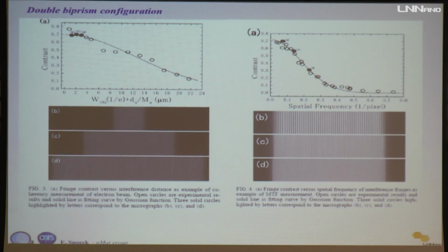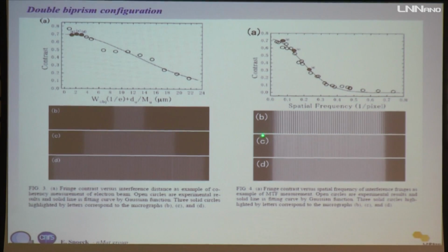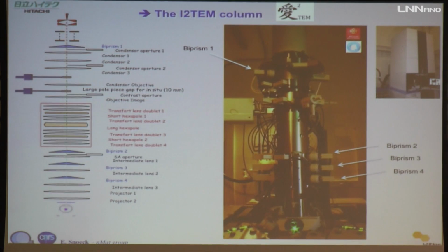What I just want to say is that in some cases, you can adapt your optical configuration in such a way that you can increase the overlap width of your hologram, keeping the same interference fringes, or change the value of the other biprism, keeping the overlap width constant, and changing the interference fringes. So it's the reason why I said in a dedicated experiment, you can do more or less whatever you want.